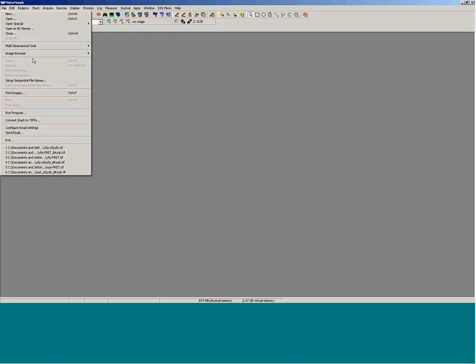In order to do background subtraction, we'll simply close these images and work through the background subtraction process. Go to the Process menu and open up Background and Shading Correction. Within this dialog, the first image we're going to deal with, we'll start with the CFP, we're going to do a statistical correction, which basically means looking at the average intensity value within the image. We want to create a region of interest in the background area, more or less where there are no cells. We'll also want to use the same area between both images.